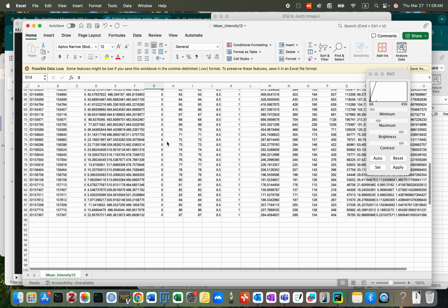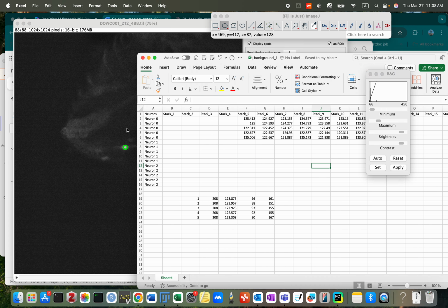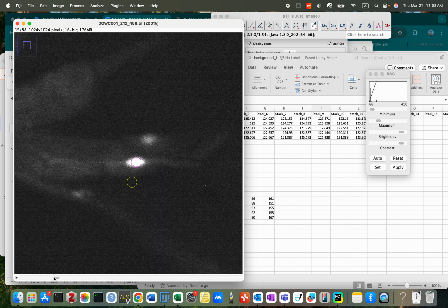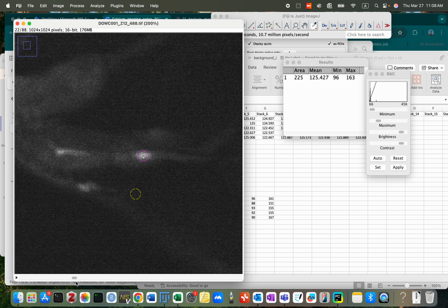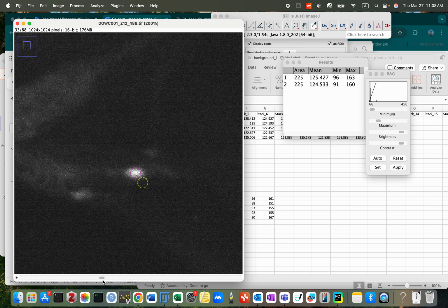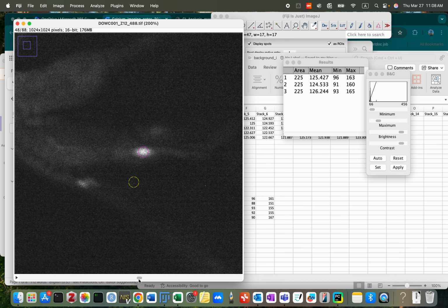So because they all belong to one track ID, I don't need to do sorting, but we have to check the duplicates. No duplicates? Nice. Save. Background. So the diameter 17. And come to time point 12. 24. 36. 48. 60.